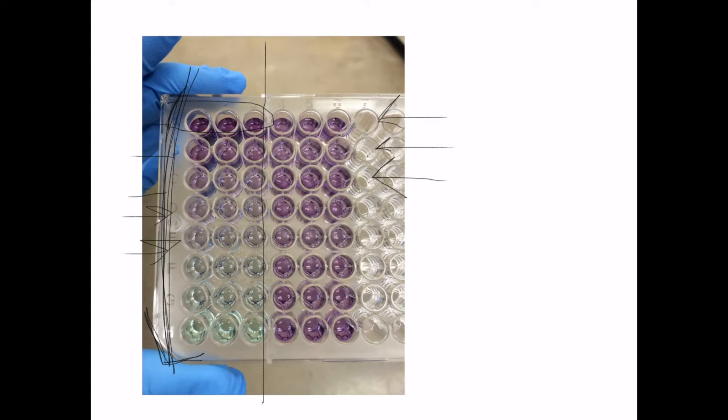So these are all done in triplicate. Why do you do them in triplicate? It improves the reliability of your results when you have three of each measurement. So that's why this looks like a lot, but really the reason it looks like a lot is because everything is in triplicate. So I'll circle some examples of triplicates for you.